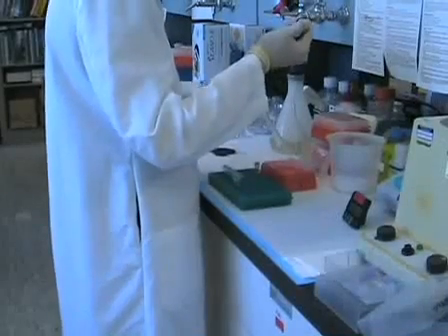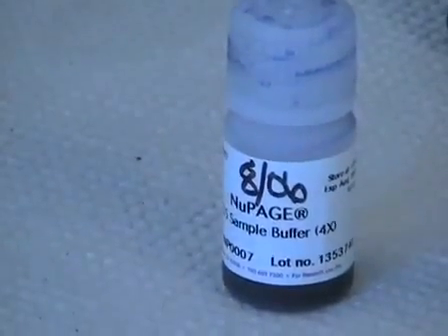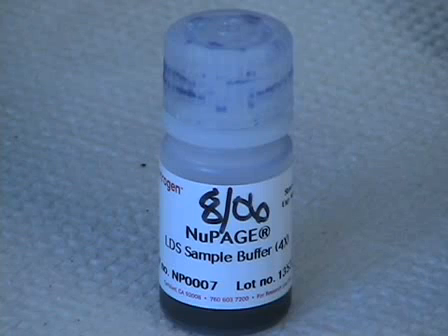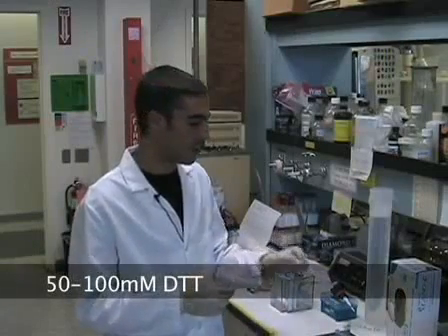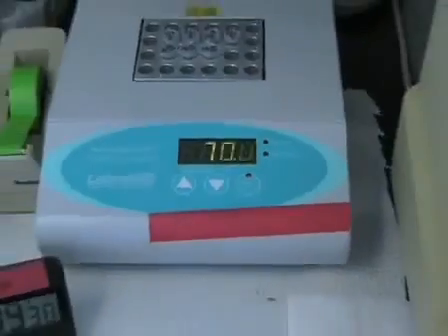I've prepared the sample. The protein samples are resuspended in a sample buffer. This sample buffer contains dye to help you load your Western blot, glycerol to help the sample sink to the bottom of the well, and also buffer and LDS. LDS is a negatively charged detergent that coats the protein so it migrates in the electric field according to molecular weight rather than charge. You also need to add a reducing agent such as DTT to break disulfide bonds. The samples are heated for 10 minutes at 70 degrees to fully denature the protein and then quickly spun down.